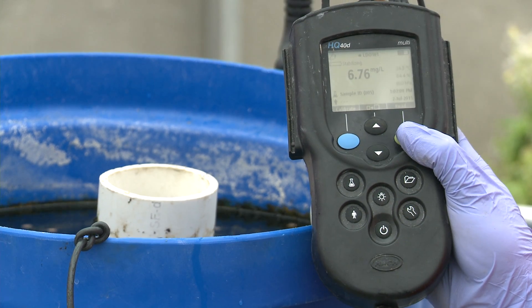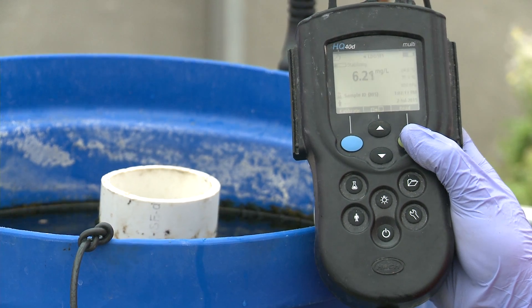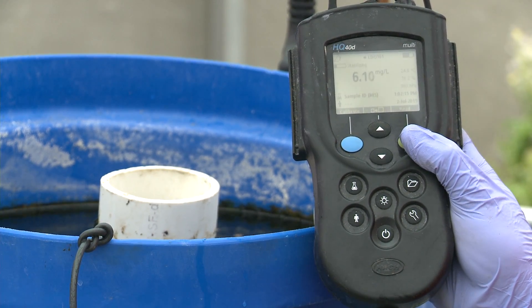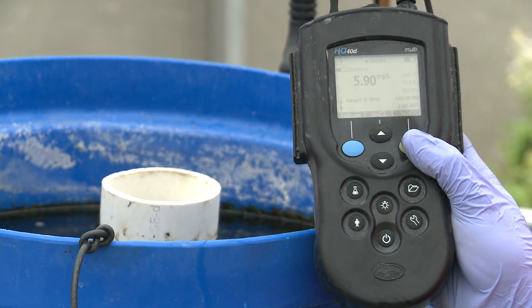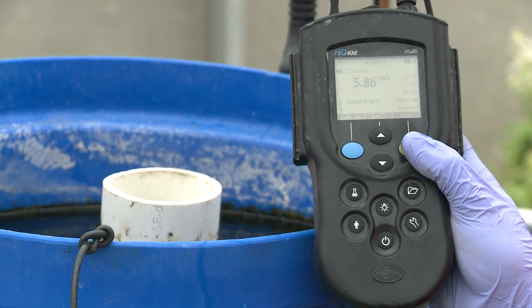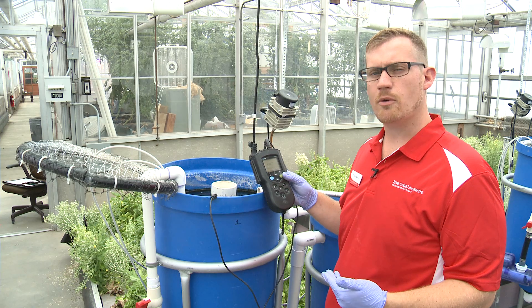That means we're going to have enough oxygen for the fish and the bacteria to do their job, and also provide good oxygen for the plant roots. Right now we're reading a dissolved oxygen of about 5.8, so that's going to be plenty of oxygen — although if it gets any lower, we might want to put some aeration on there.